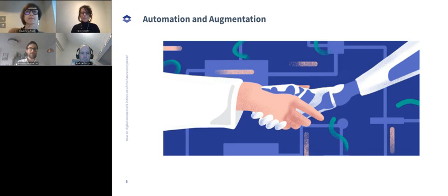But we're still a bit far away from that manufacturing process in R&D, where you have one big plant or one big machinery where your sample runs through end to end. And the point is, will that ever happen in R&D? Will there always be the need for full automation in R&D? Or is R&D actually about having distinct activities that will never be automated right from the start, where you just start kind of small?